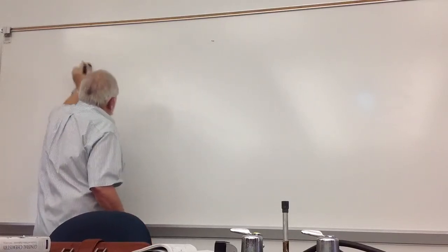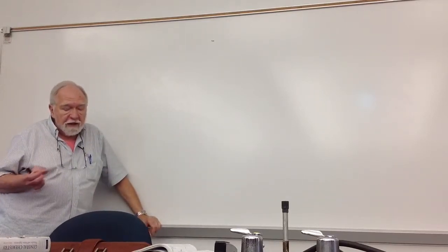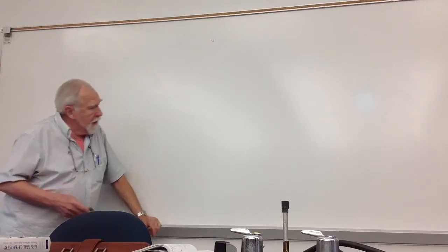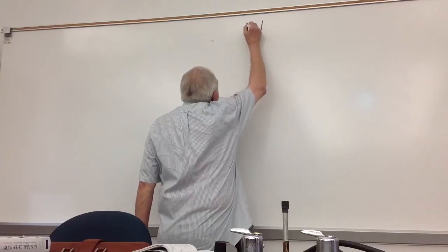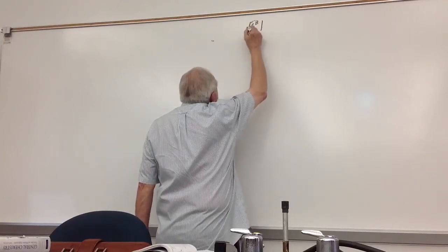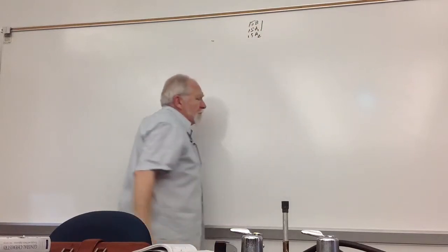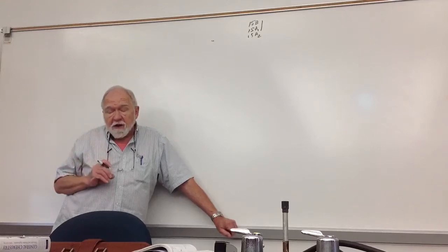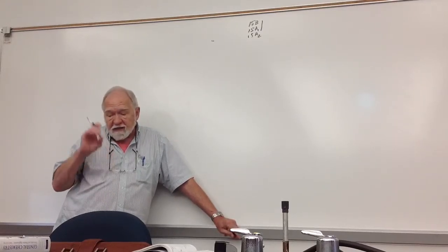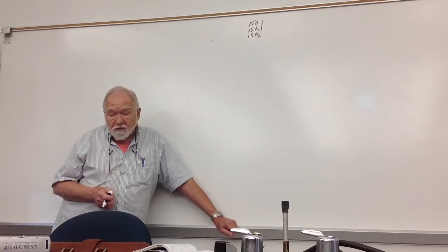And I said for convenience for experiment 3, we'll leave out the manganese and we'll leave out the nickel. Nickel, I said, we'll do a separate experiment. And I went through, and I'm not going to do all this again. Notice we start off with 15B for the known, but you don't have to start off with 15B for the unknown. The B part just reduces the volume so you get to a reasonable size sample that you can work in the test tubes. The unknown is always going to come in 6-drop portions.